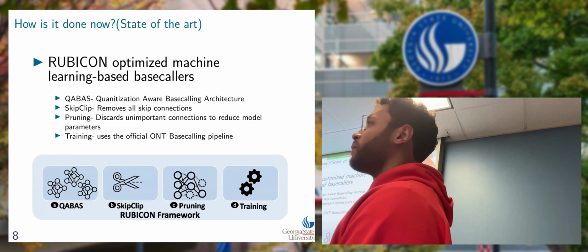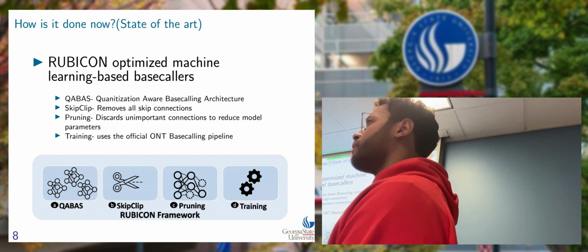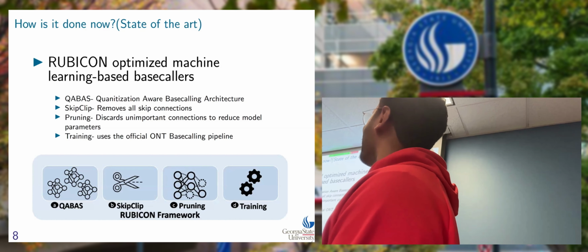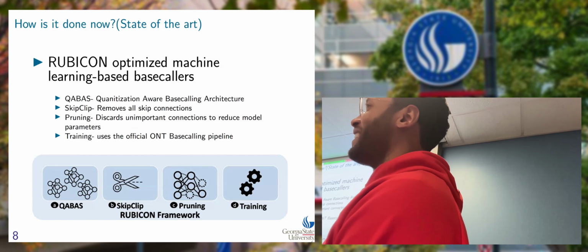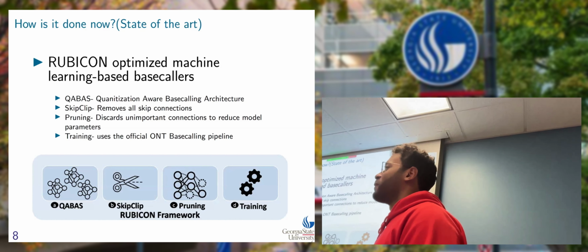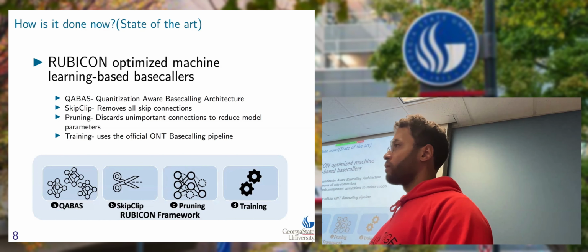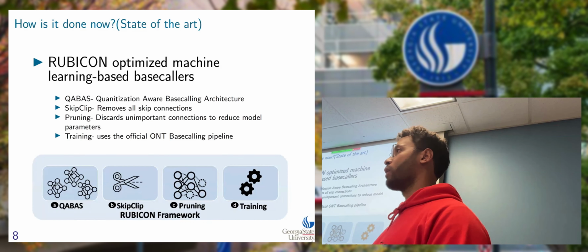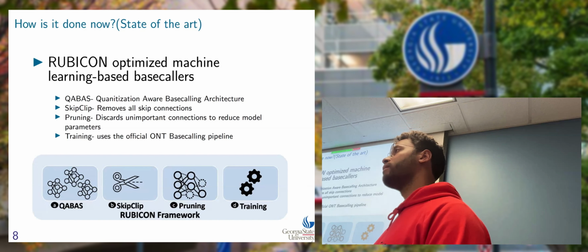About the base caller from ONT. The Nanocall? Nanocall is very old. Any of the most recent ones? Stay tuned. In one day? One day. Okay. Yeah, I think it's straightforward, right? You don't need to train. You already have the trained content, so you just download it. Okay, gotcha. There are lightweight versions of it.